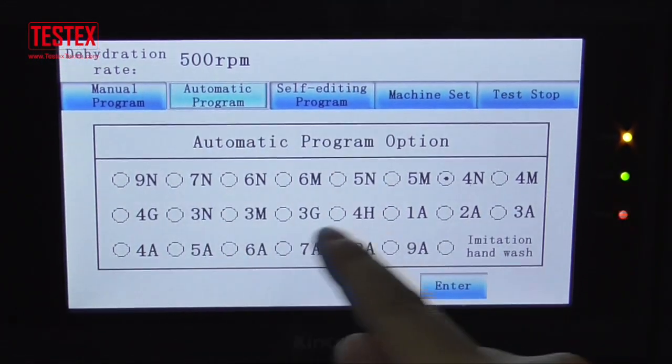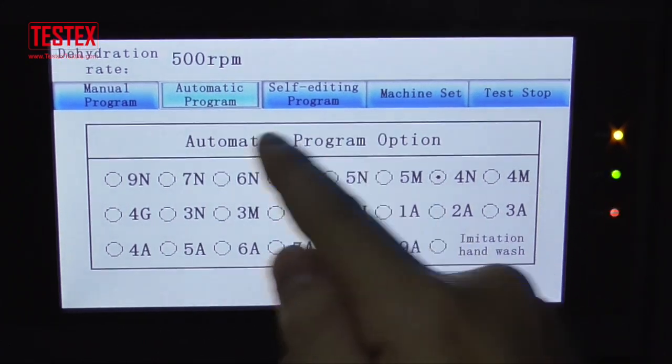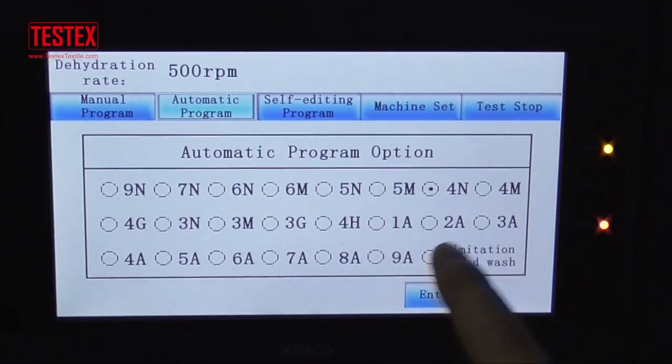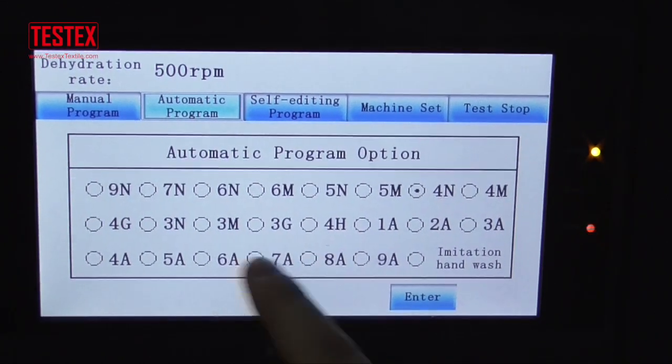And here is the auto testing program. Reset. We have set it on here by the testing station.